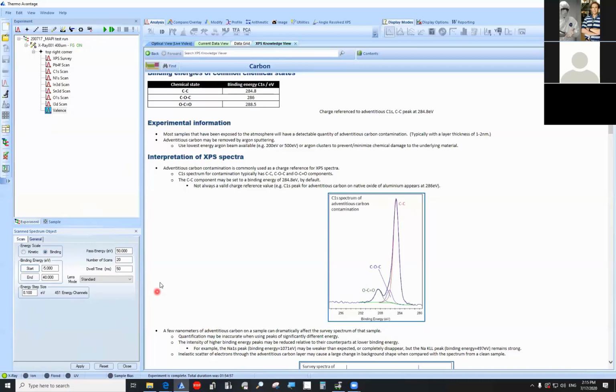All right. So from this stage, we've started an experiment. We've configured a source. We've configured a point. And we've configured the scans that are associated with that point. Anybody have any questions about this kind of hierarchy? So notice that an experiment has multiple sources. Sources can have multiple points. Points can have multiple scans. But they all have to be nested in this hierarchy.